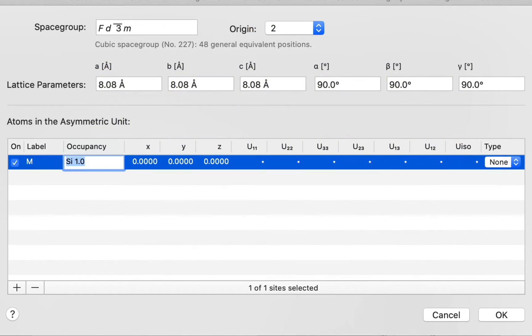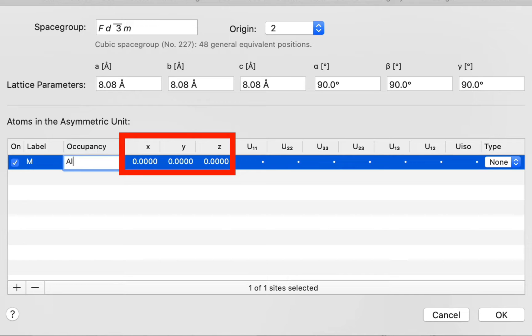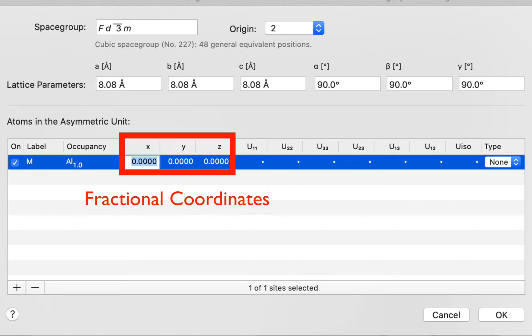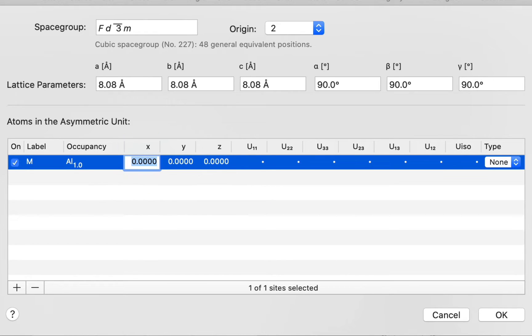Occupancy is essentially the chemical formula for the site. You need one or more element symbols matching those in the scattering factors pane of the preferences panel — that's how Single Crystal relates the diffracting power of a site to its tabulated values. In this site I'm going to enter aluminium; I just want 100% aluminium so I don't need to type 1.0. I could have a mixed occupancy, but the occupancy total cannot exceed 1. Moving on to x, y, and z coordinates — these are fractional coordinates, fractions of the unit cell repeat distance, not absolute distances. I'm going to specify this site at a half, a half, a half.